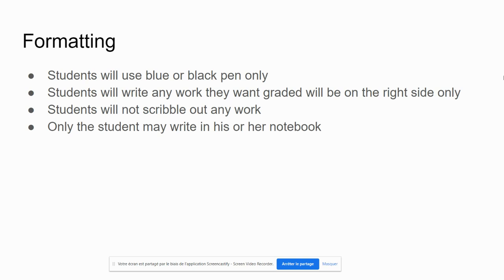A lab notebook is effectively a legal document. Yours will, of course, not be used in that sense of it, but I want for you to just be familiar with this in the event that you need to do this stuff in any other sort of capacity later in life.